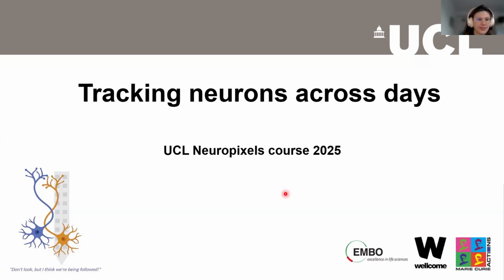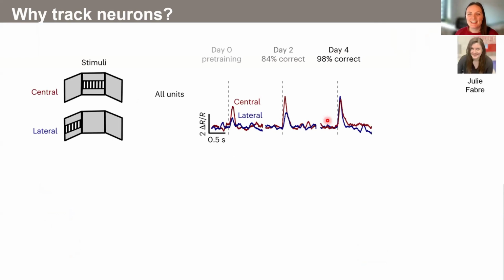All right. So today's last session is about tracking neurons across days, as Laura just mentioned. We're a bit ahead of schedule, but I'll try to keep it short anyway. So why would we want to track neurons?